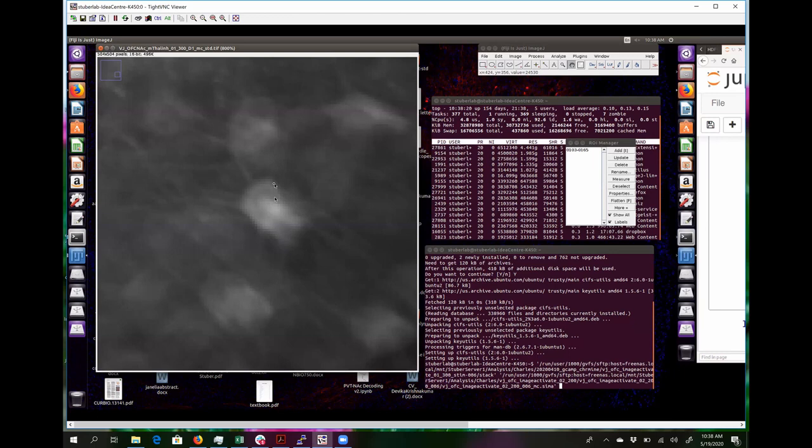If I were to draw something like this, I would assume that people won't have an issue when I say that every pixel here is actually part of the cell.